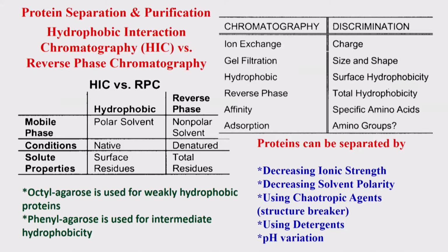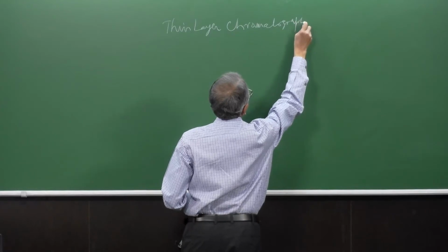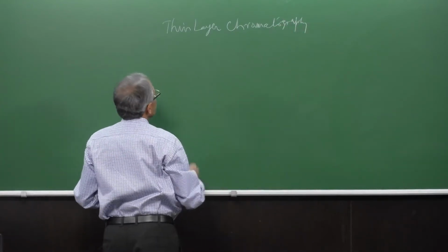So what we have looked at till now is thin layer chromatography. These are the basic principles of that.